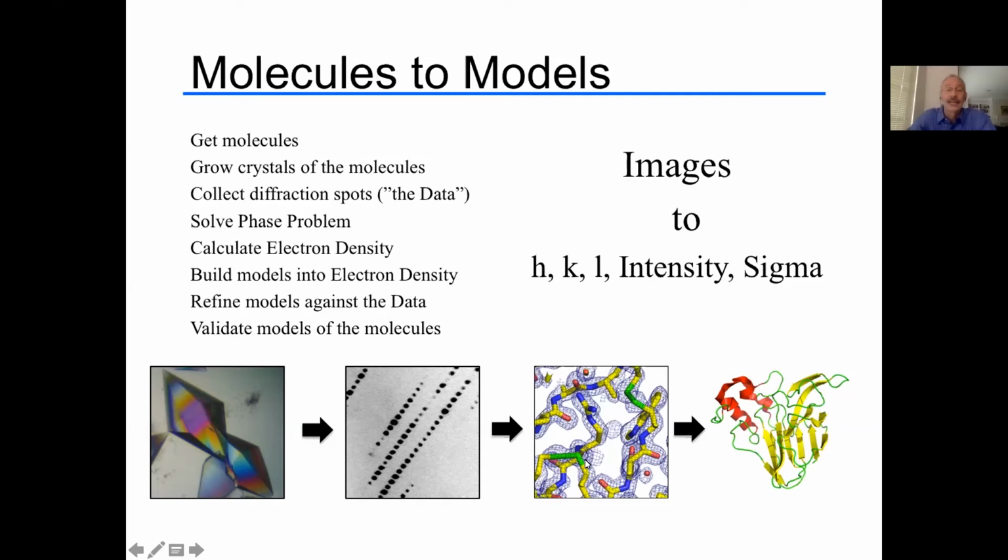And I saw the electron density equation in Jean-Luc's talk, and that would give rise to a display of that electron density, which is this wire mesh, and you can interpret that in terms of the molecules that are there. And this is a molecule of thaumatin.